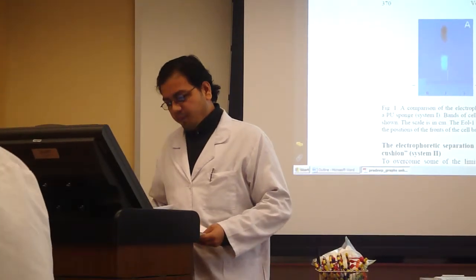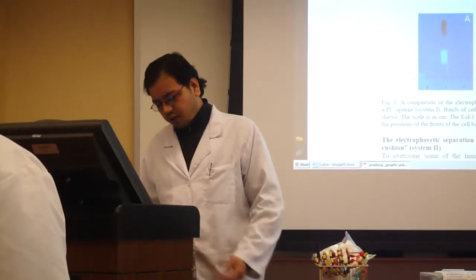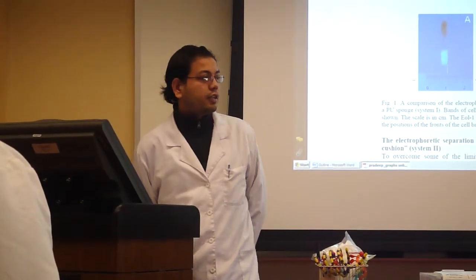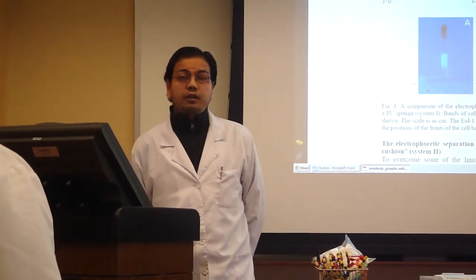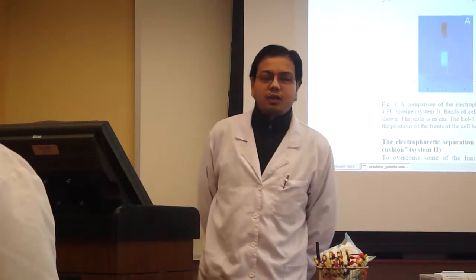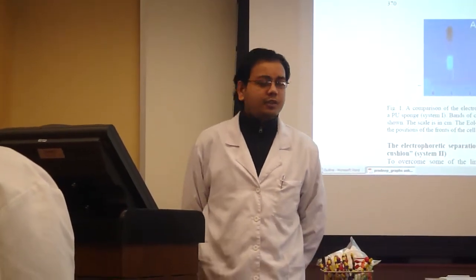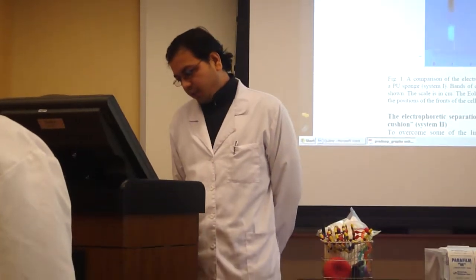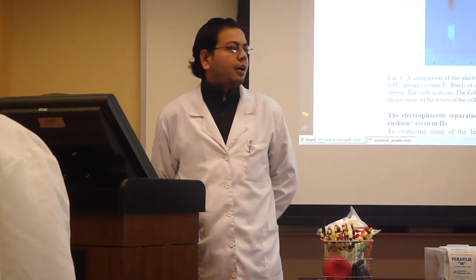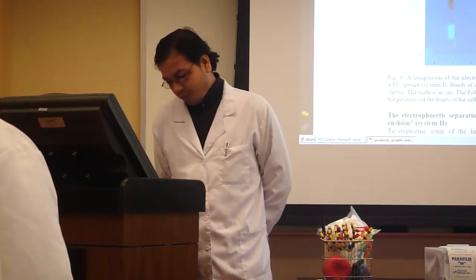Let me introduce my topic first. Our topic is about the cell separation with the horizontal cell electrophoresis under isopycnic conditions on a density cushion. Isopycnic conditions, you all know about isobaric, right? That's the same pressure. Isothermal, that's the same temperature. And this isopycnic thing is the condition when the same density is provided.